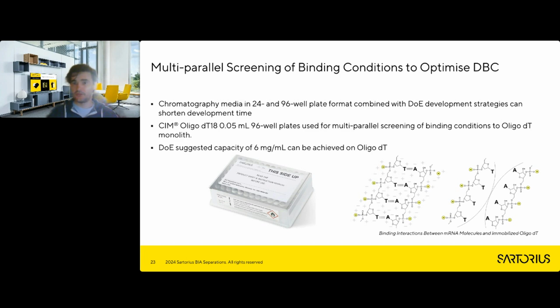We did 84 experiments, then did two-level screening and used a multiple regression model to fit our results and refine them with backward selection using a p-value below 0.05.